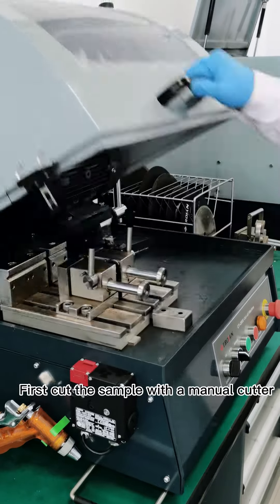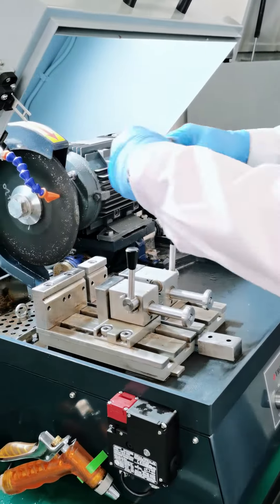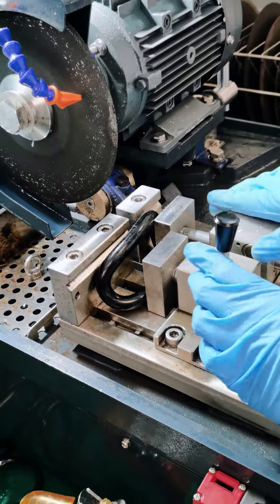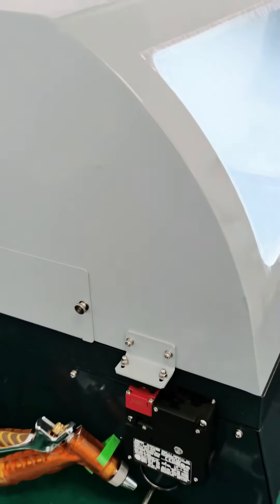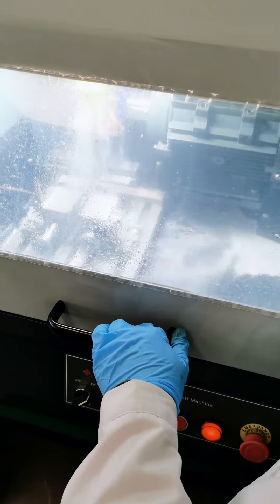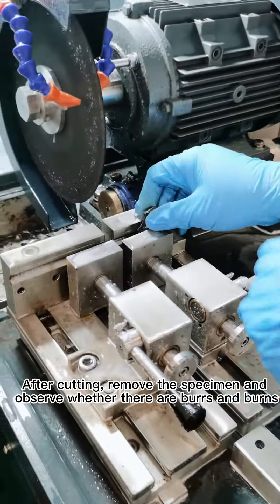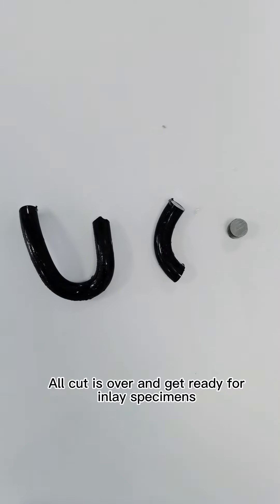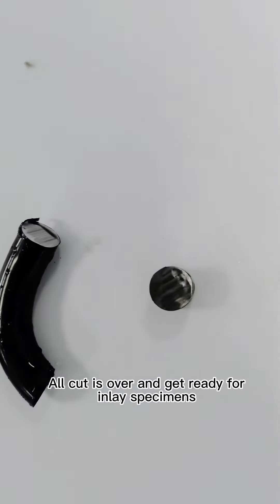First, cut the sample with a manual cutter. After cutting, remove the specimen and check whether there are burrs. All cutting is done and the specimen is now ready.